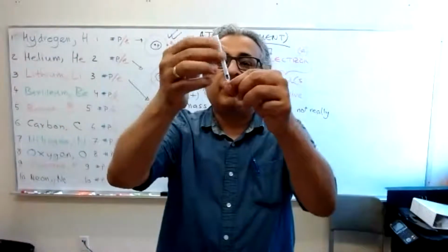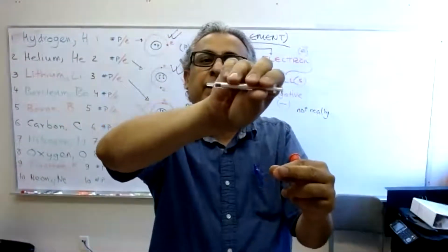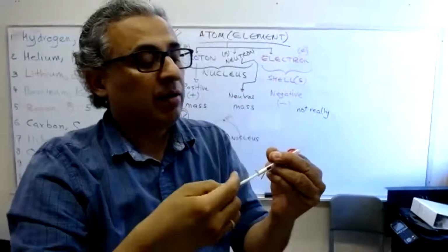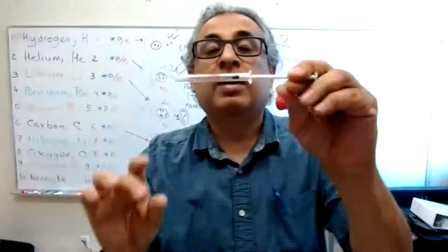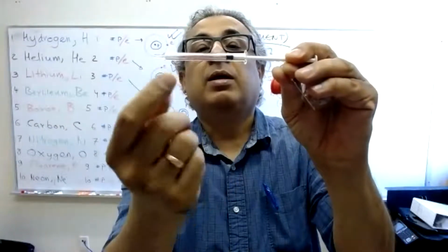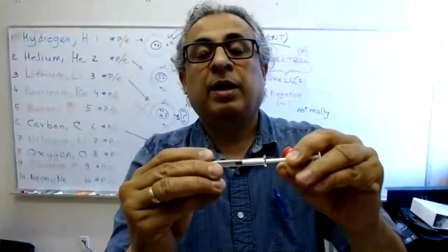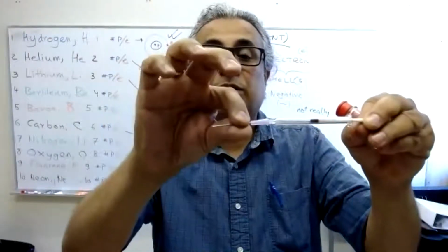This is a syringe. If you want to add a precise amount of reagent, sometimes you may have to do that. I don't think you can read it here. It's a 1 ml syringe. It says 0.1, 0.2, 0.3, 0.4, 1 ml. So this is 1 ml, and somewhere here it'll be 0.5 ml. This is just like a syringe, and that's a needle that goes on the top.